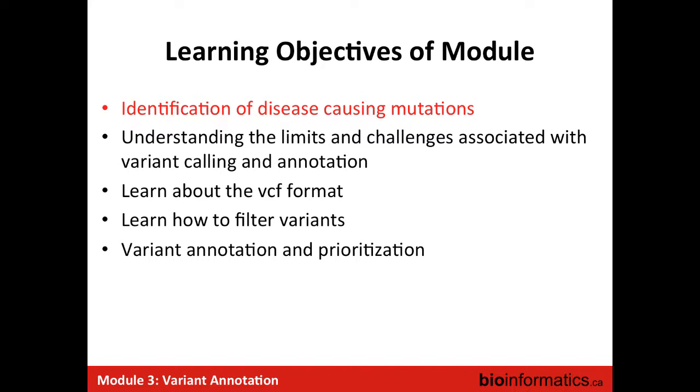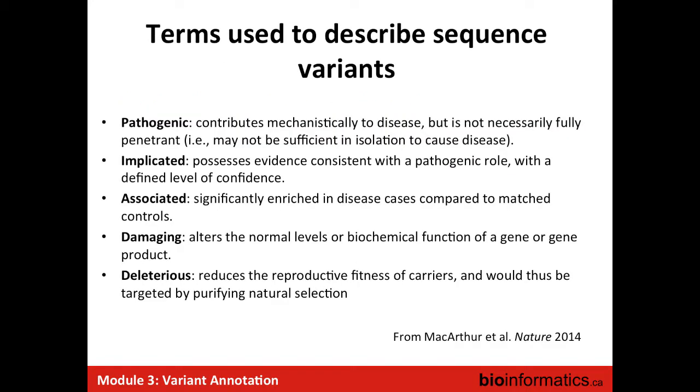First of all, the overall objective here is to identify disease-causing mutation. Mike touched on that a little bit, but the terminology is important here. So you've got pathogenic mutation, which is what we're trying to identify, that contribute mechanistically to the disease. Again, it's not necessarily fully penetrant, but the objective is to identify these.